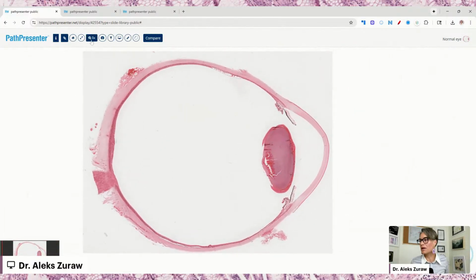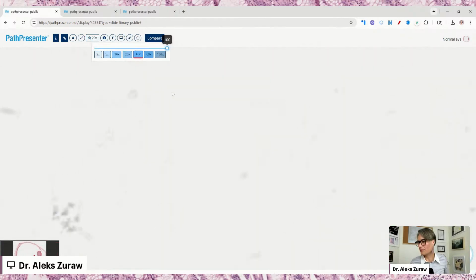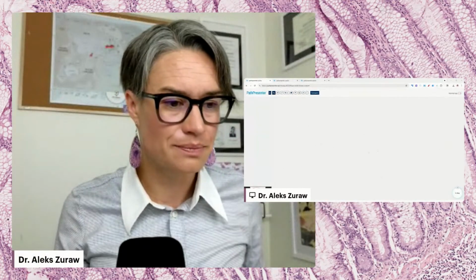You can see all these landmarks at low magnification. It's telling us it's 0. I don't think this is accurate. Maybe it is accurate. Zero magnification, that's true. Come on, what's going on? What did we do? Oh, do you see this little thumbnail? Actually, you cannot see it, but I'll show you in a different way.